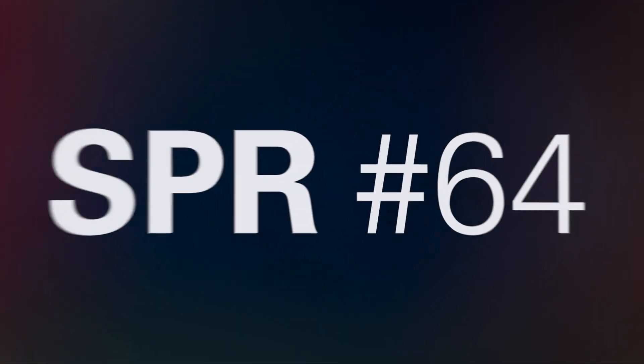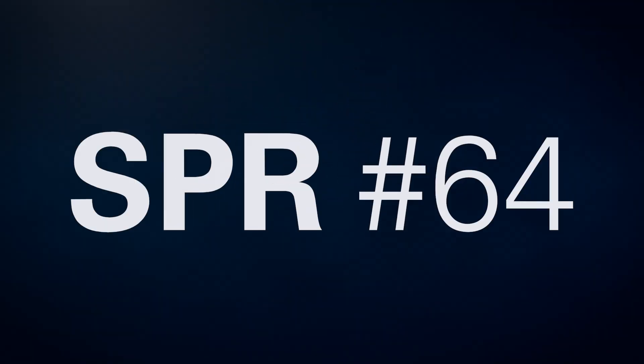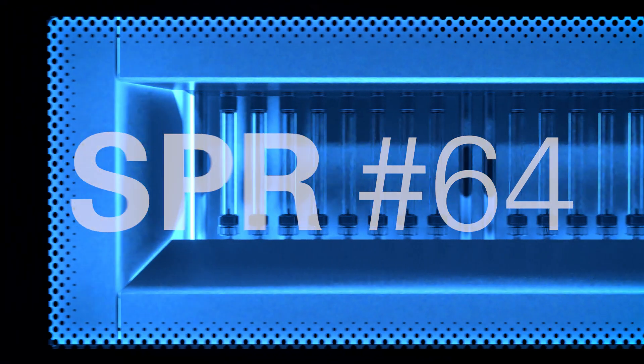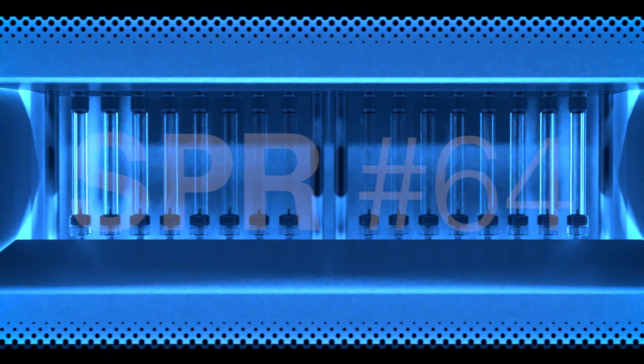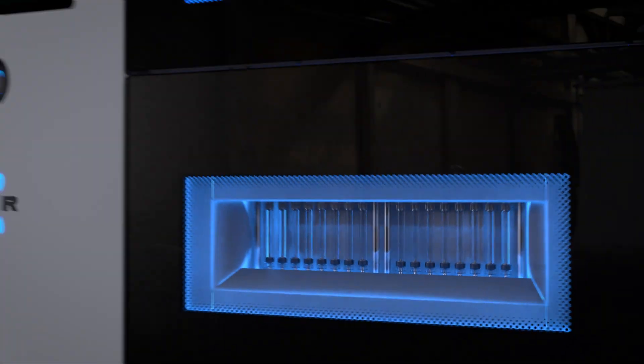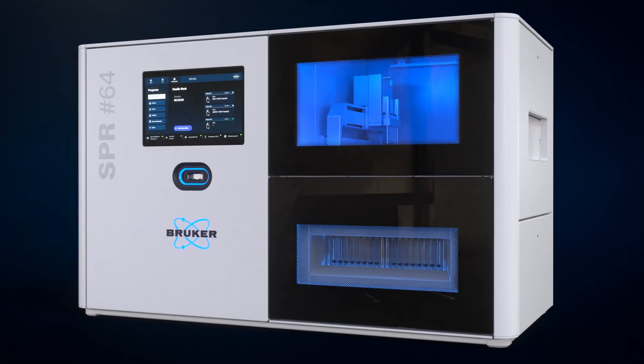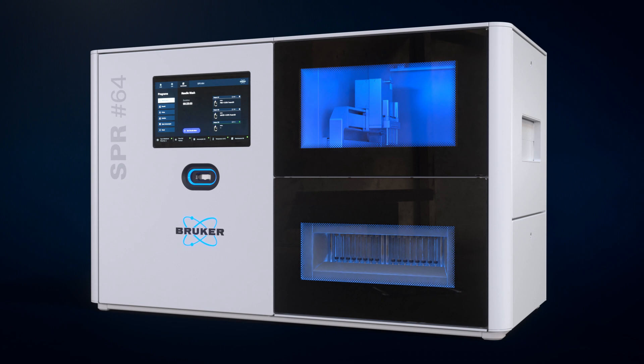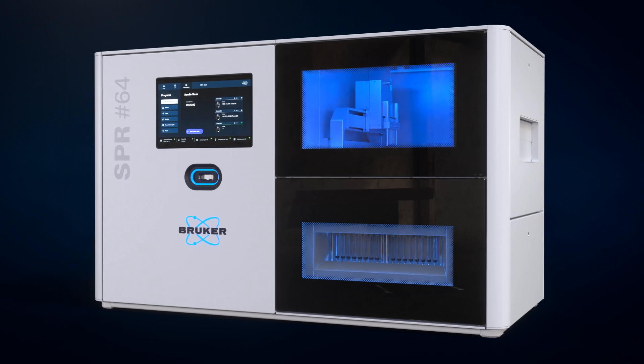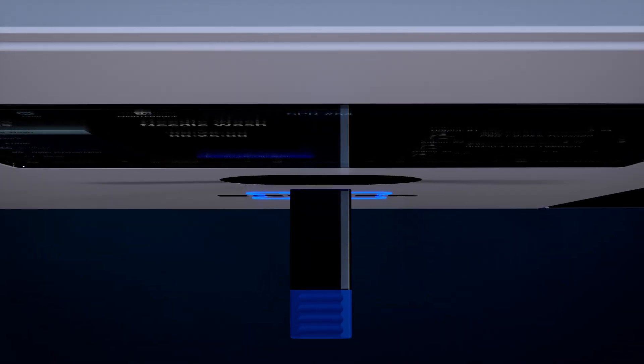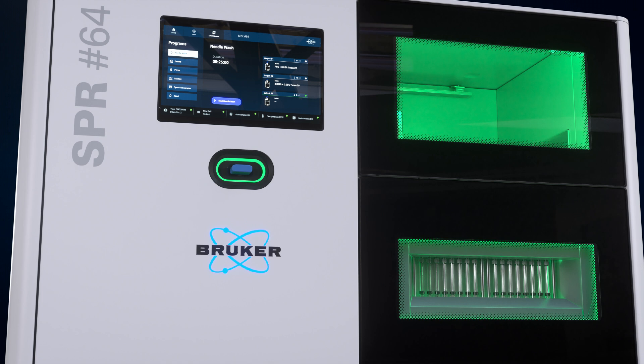Bruker's new SPR-64 fulfills the need for a high-quality, high-throughput SPR system, offering an array of 8x8 sensor spots which can be addressed in perpendicular orientation.